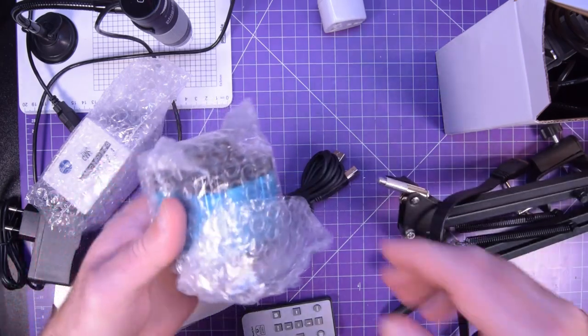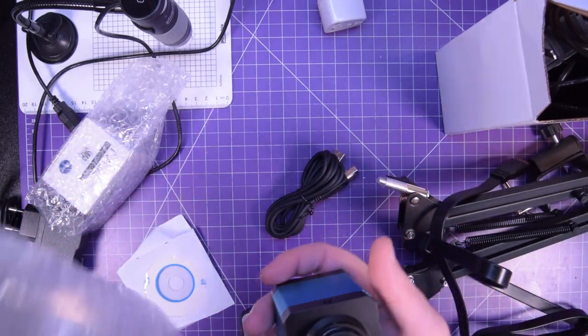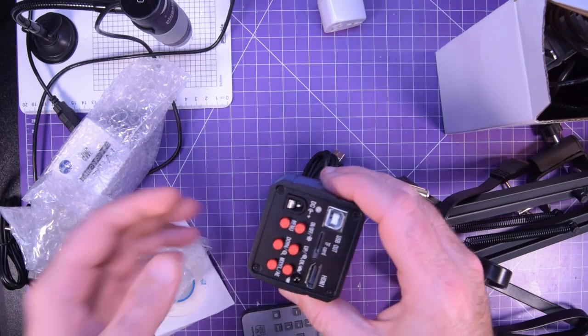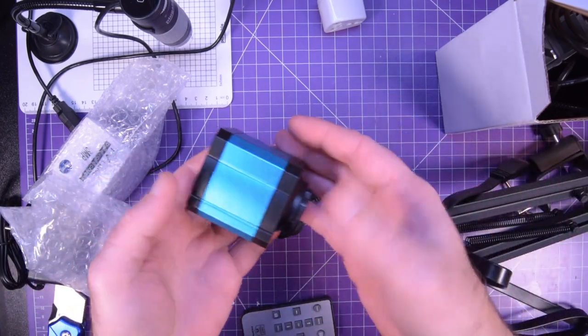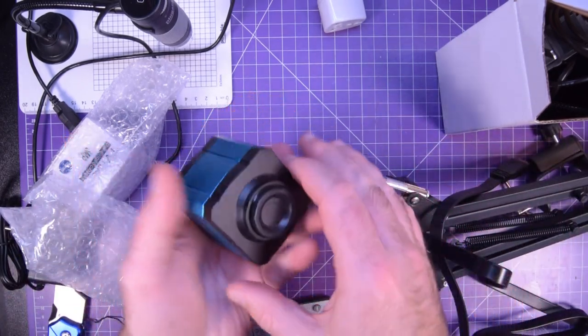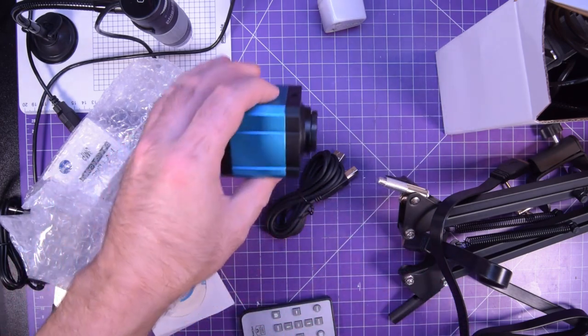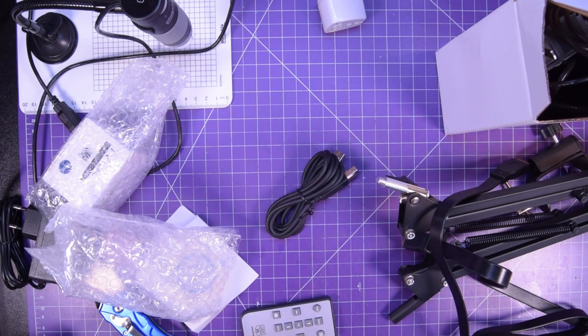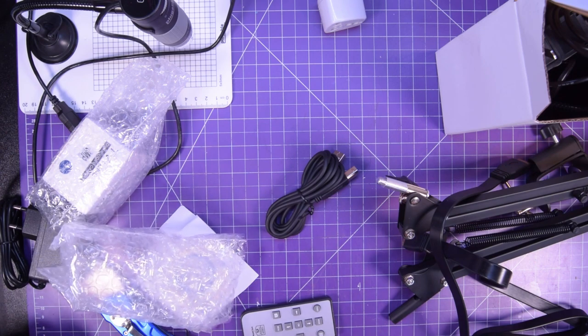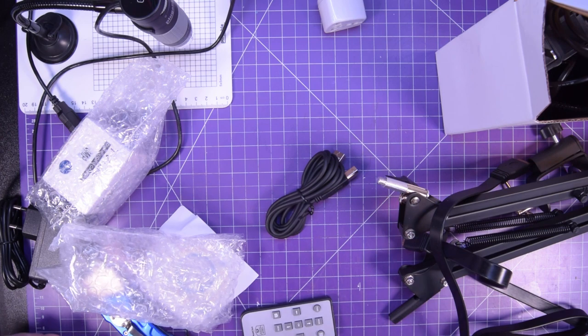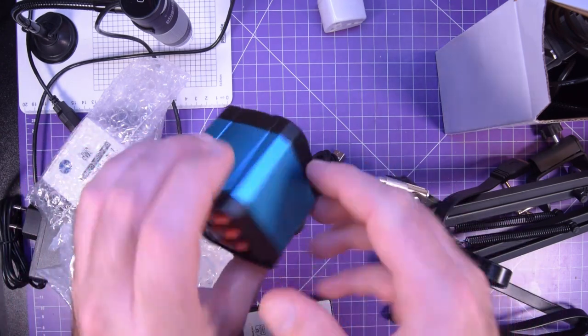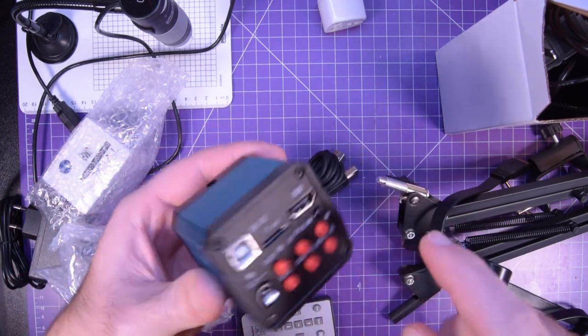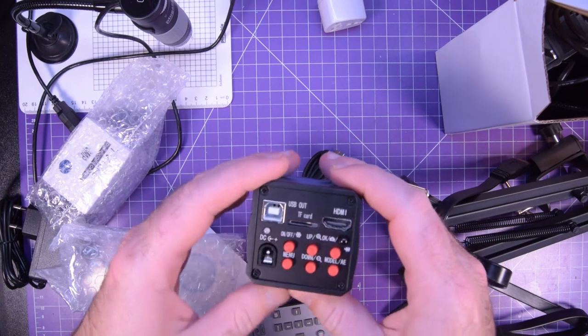And this is the star of the show. So, if you go take a look at the link for this camera, you'll notice that it's hard to really get a gauge of how big it is. But here it is in my hand. It is actually fairly small. It is about 50 mils by 50 mils by 55 mils. It's got a 1/4-20 here. Oh, and a 1/4-20 on the other side. So I don't know what side is up and down.